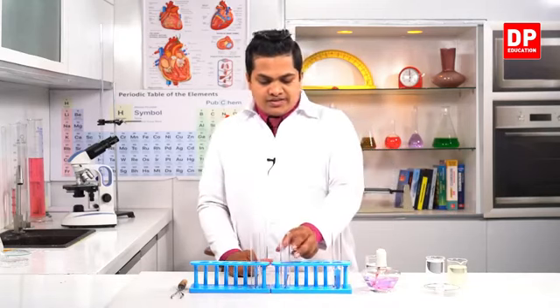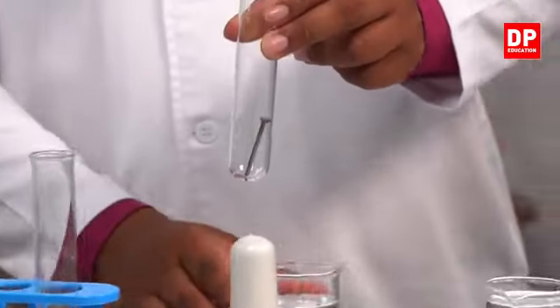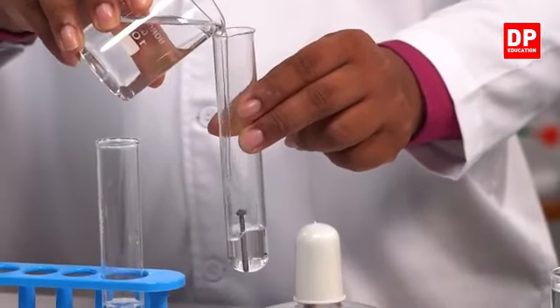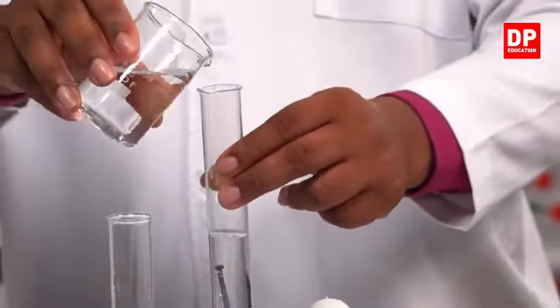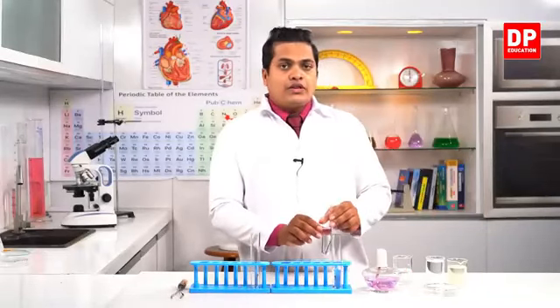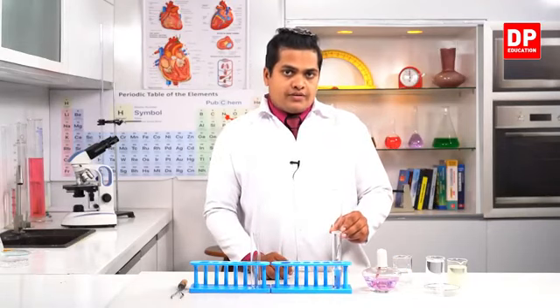Then I'm going to use the second test tube, this one. Once again, I'm going to put some amount of normal water like this. Then for this, I'll be inserting some amount of coconut oil, right?